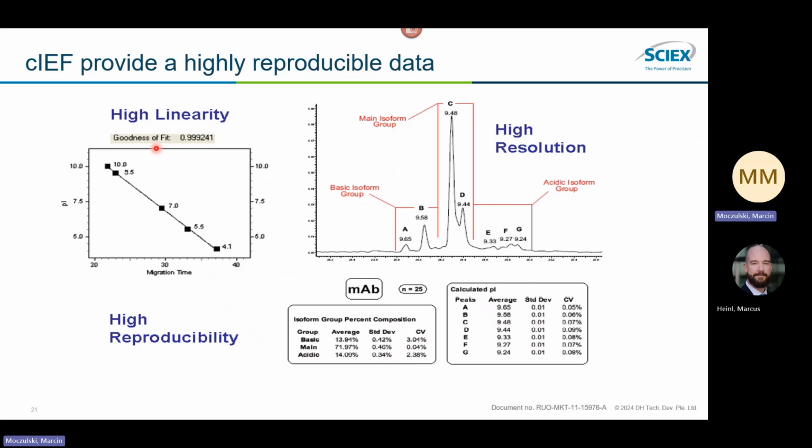Finally, we don't need them for final peak identification, so the method allows us to exclude them from final integration, and we can focus only on integrating our final peak profile, where the first peaks are much more basic, then the middle range main peaks, and the last group concerns acidic groups.